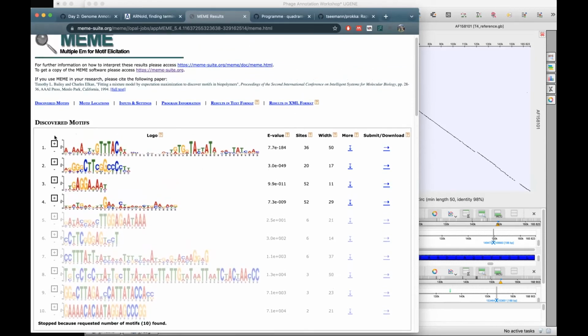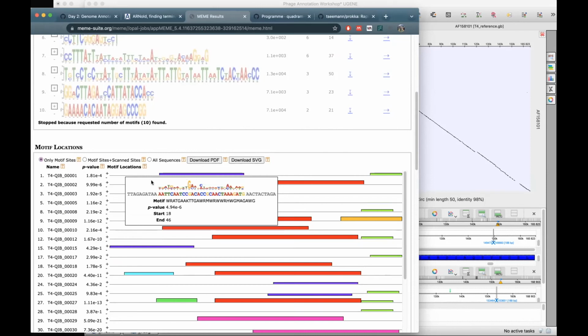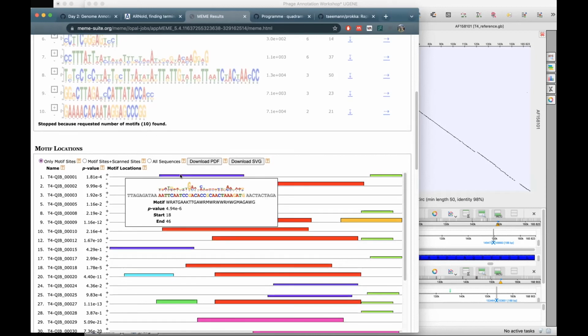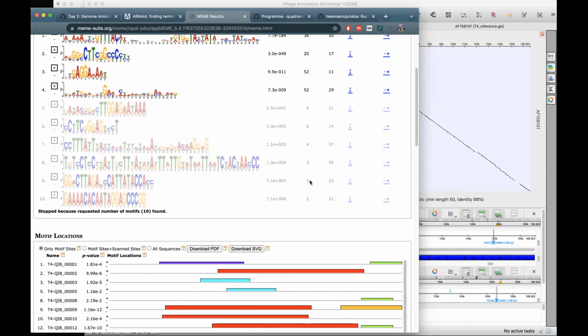So with this one, we were able to predict, just based on agnostic pattern searches, our promoter sequence in 36 sites. And then we can have a look at a visual representation of all of our locus tags here, and we can see the motifs that were present in color codes matching these up top.